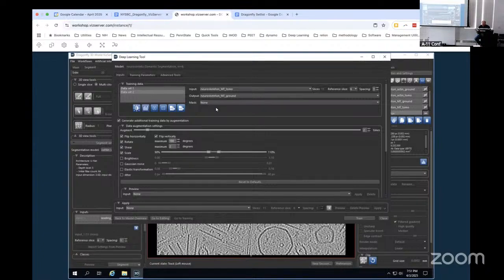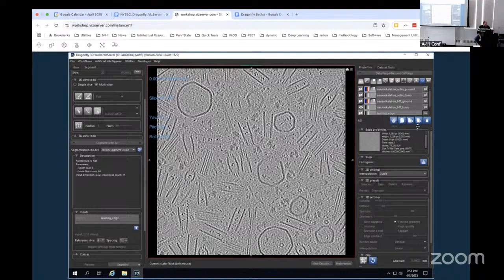I don't think you guys need to see me hit train, but you would train this just like we did the rest of them. And you'd see the learning curve. And then at the end, you would test to see that it even works. So like, let's take this data set.